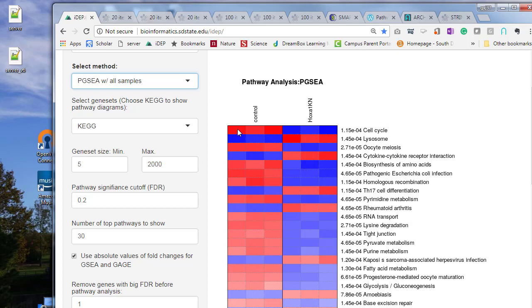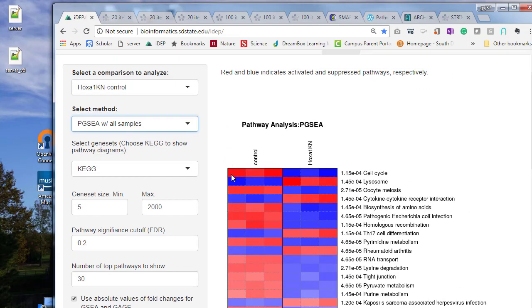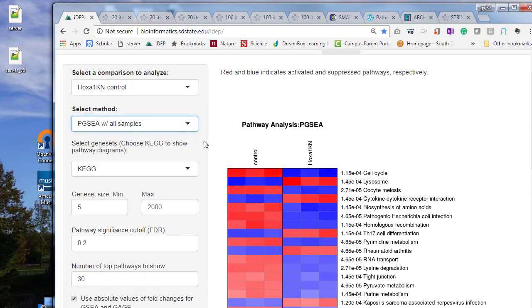So these pixels, you can think of them as the average gene expression of cell cycle related genes in this sample. So these are 3 samples. Okay, so these cell cycle genes are highly expressed in here, low expressed in here. You might recall this is very similar to the principal component analysis result. Okay, there are 2 types of plot.